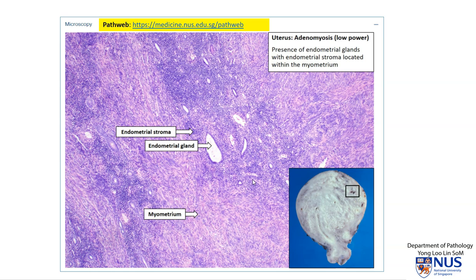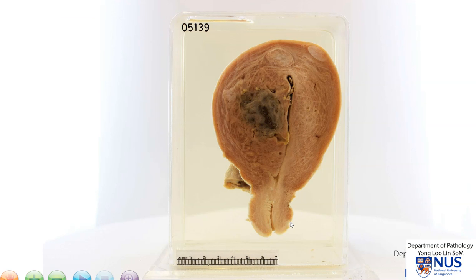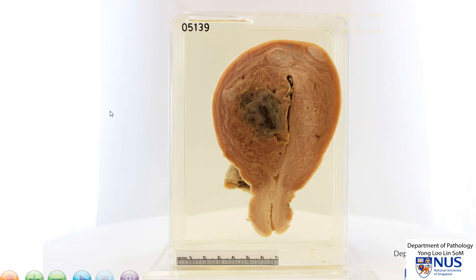This is a benign process and usually can be managed with medical treatment. In summary, this is a specimen of a longitudinally bisected uterus where the myometrium is thickened and trabeculated, with areas of hemorrhage including small punctate hemorrhages and focal larger areas. There are also a few small, well-circumscribed ovoid nodules in the myometrium, which represent small fibroids or leiomyomata.